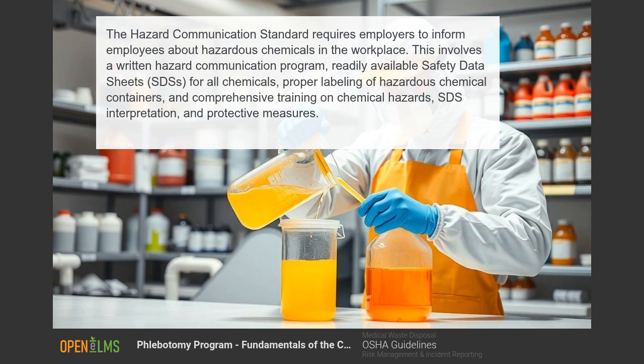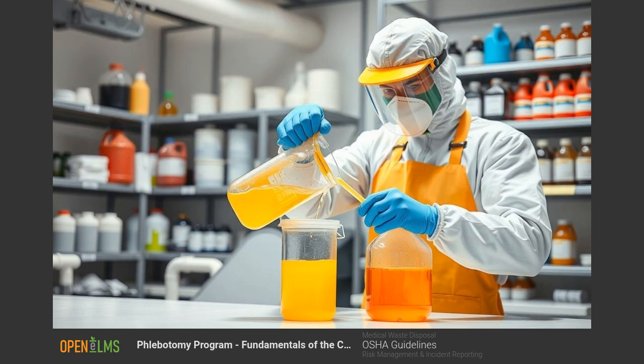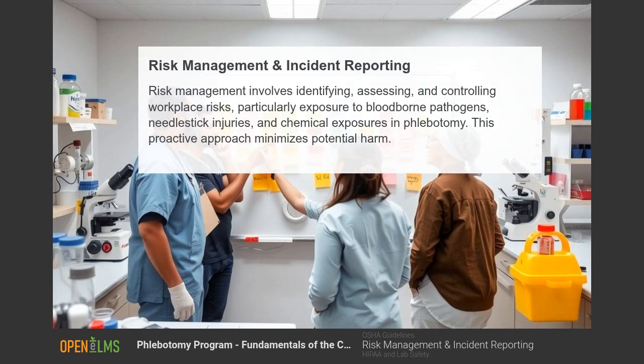The Hazard Communication Standard requires employers to inform employees about hazardous chemicals in the workplace. This involves a written hazard communication program, readily available safety data sheets, SDSs, for all chemicals, proper labeling of hazardous chemicals, risk management and incident reporting.